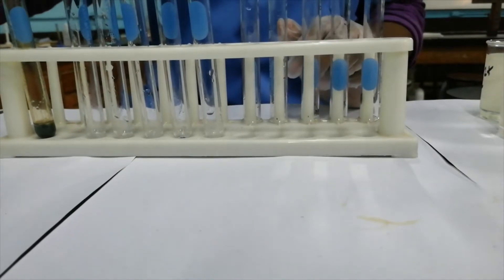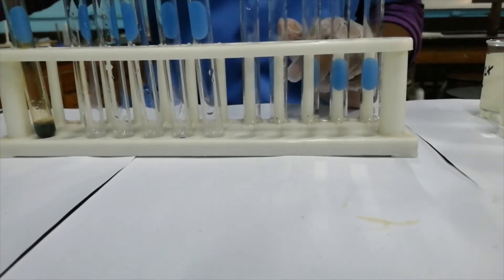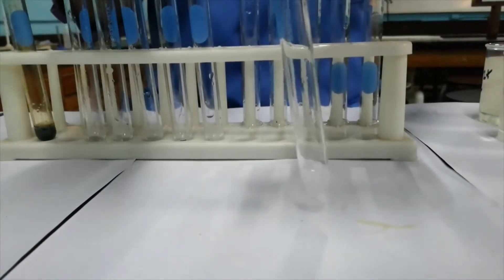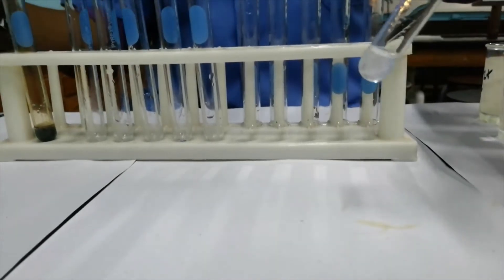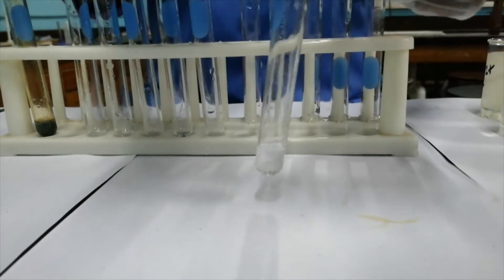I'm going to pour off most of what is in the test tube and add excess sodium hydroxide solution to it to see what happens. So the white precipitate has dissolved in excess.